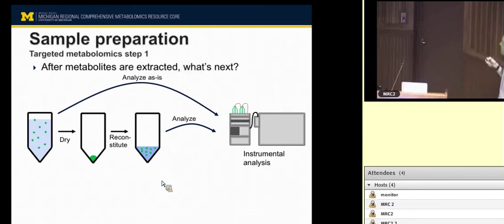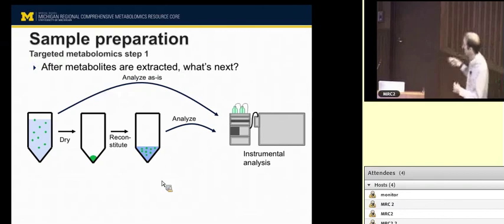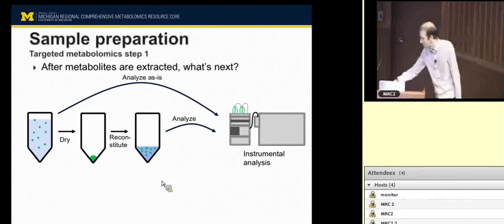And then from this signal, we look at the area under the curve to get the quantitative estimate, and then we have a table of metabolite abundances. This is not yet concentration values. If we want to go further, we can do some sort of calibration, not unlike a calibration you would do with any other assay, except it's using mass spec data, and we have a separate calibration for each metabolite based on the peak area. I'm sorry, the calibration between the measured peak area and the concentration. We might use the ratio of your metabolite to an internal standard peak area. And then we will generate quantitative data from there.